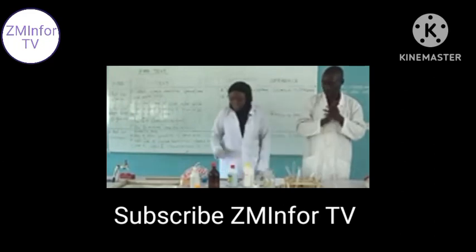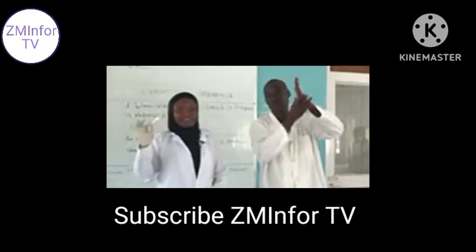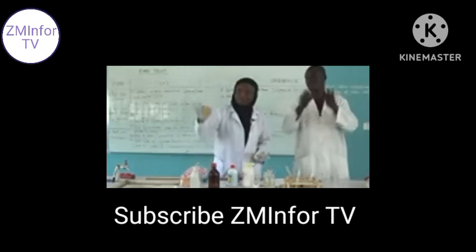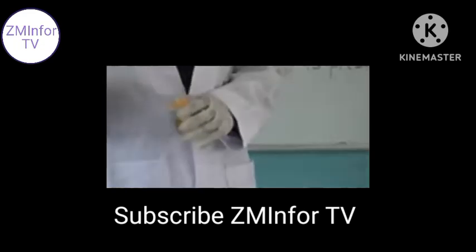Now we test for oil. This is a filter paper. You can use any available white paper. We have oil here. We drop some of it on the paper.